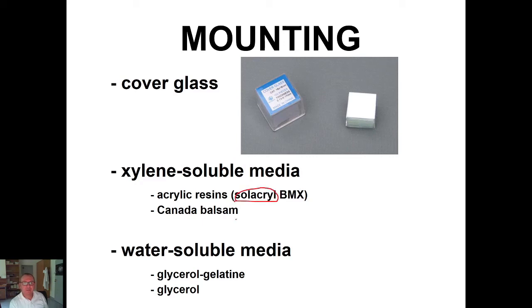Solacryl is an acrylic resin which is sticking the cover glass like glue, and the result is protection of our specimen.